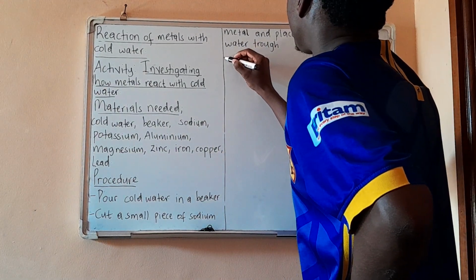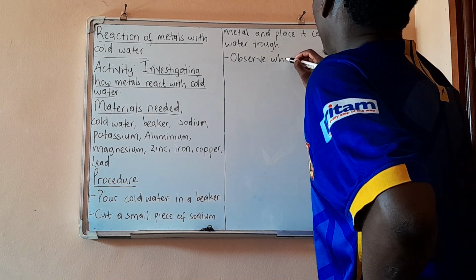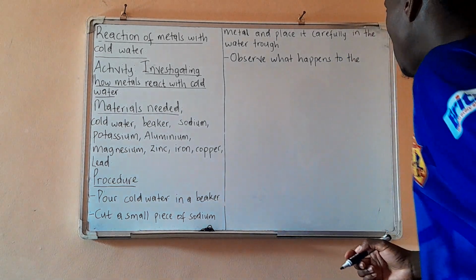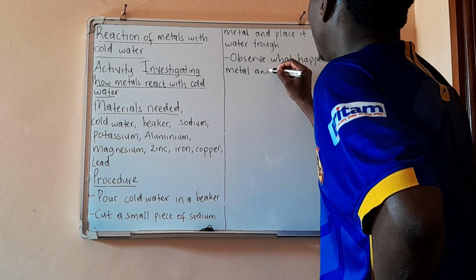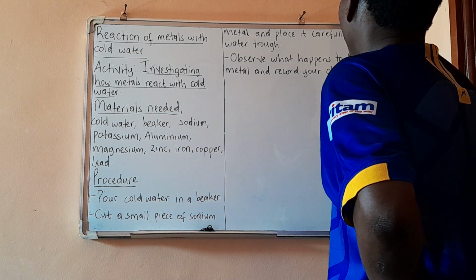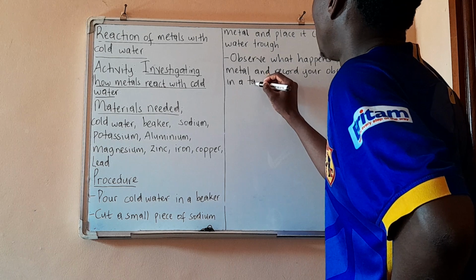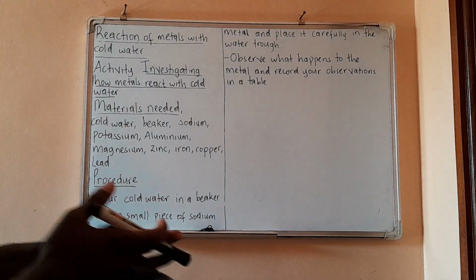So observe what happens to the metal and record your observations in a table.